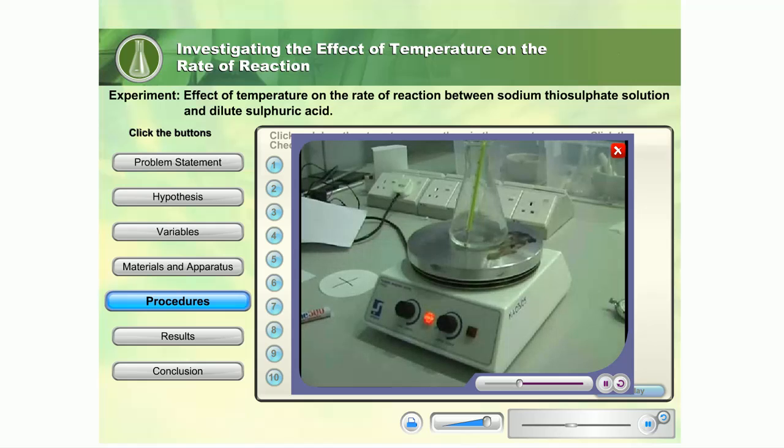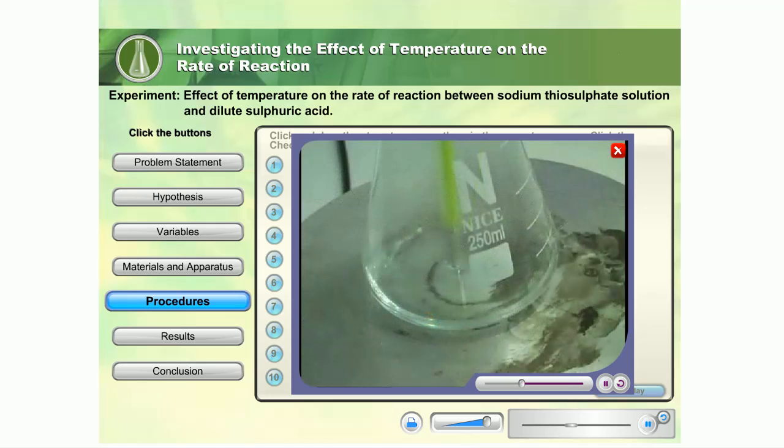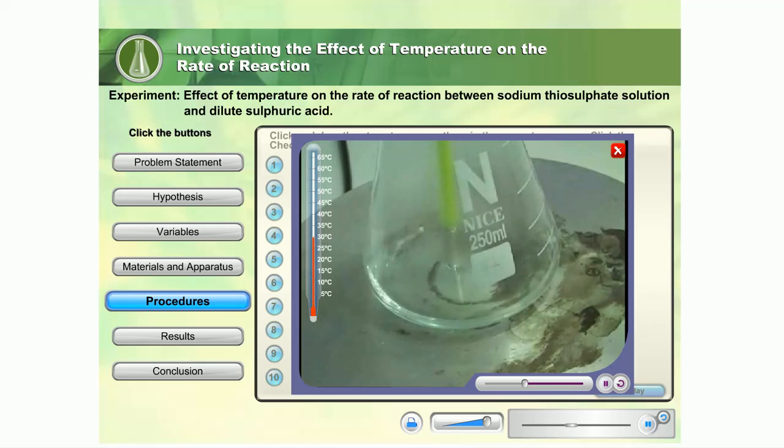Heat the conical flask to 30 degrees Celsius. Measure the temperature of the solution with a thermometer. Record the temperature reading.